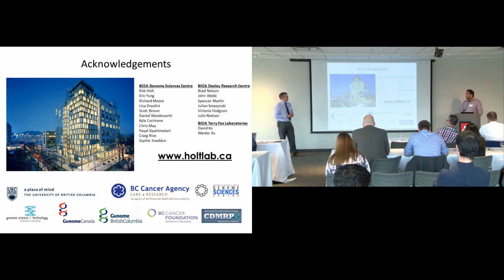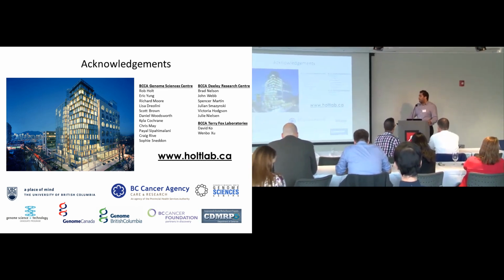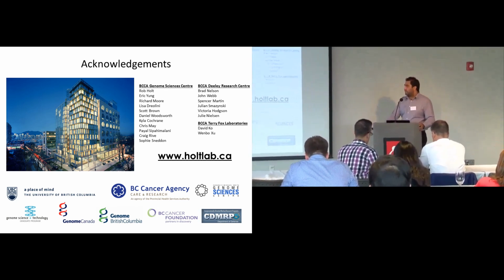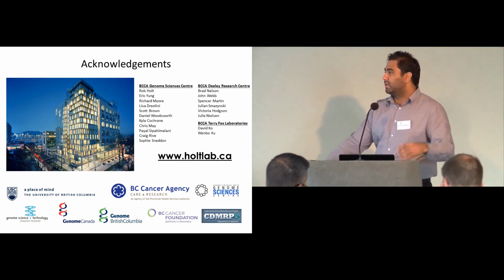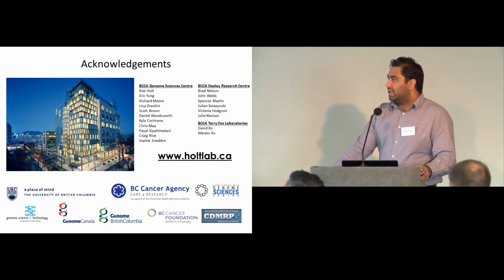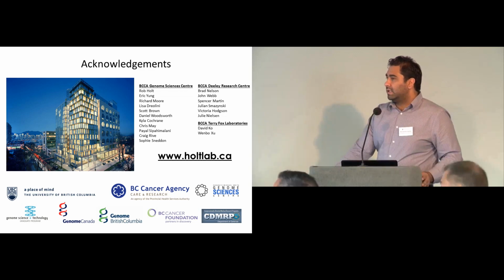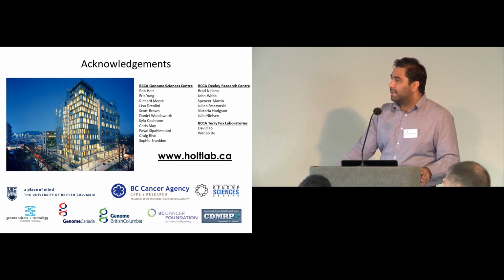Yeah, generating a minigene library to be screened is very analogous to generating a fragment library to be sequenced. So rather than putting them on a sequencer, I would put them into a viral vector and then transduce and screen. I anticipate, and in practice so far, it is a relatively short timeline, weeks before we can get sequences of epitopes or putatively antigenic minigenes so that we can then mine and verify and so on.